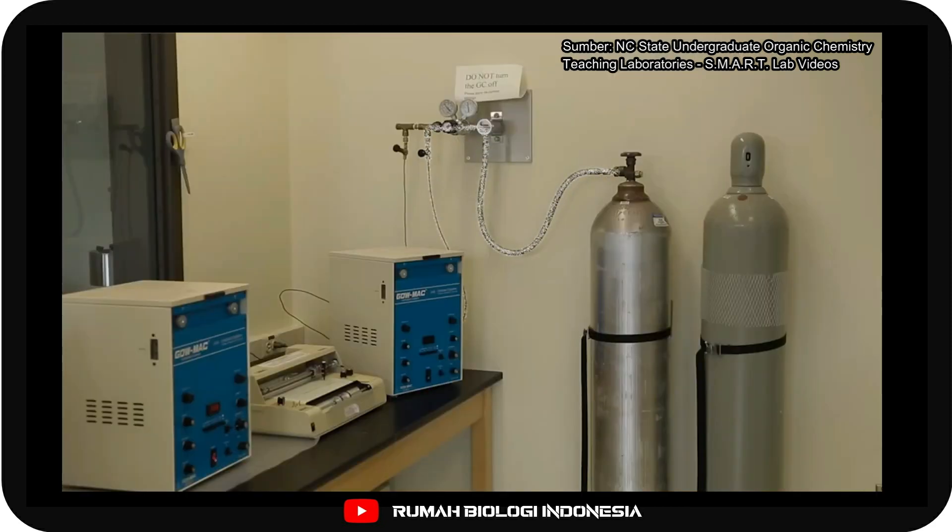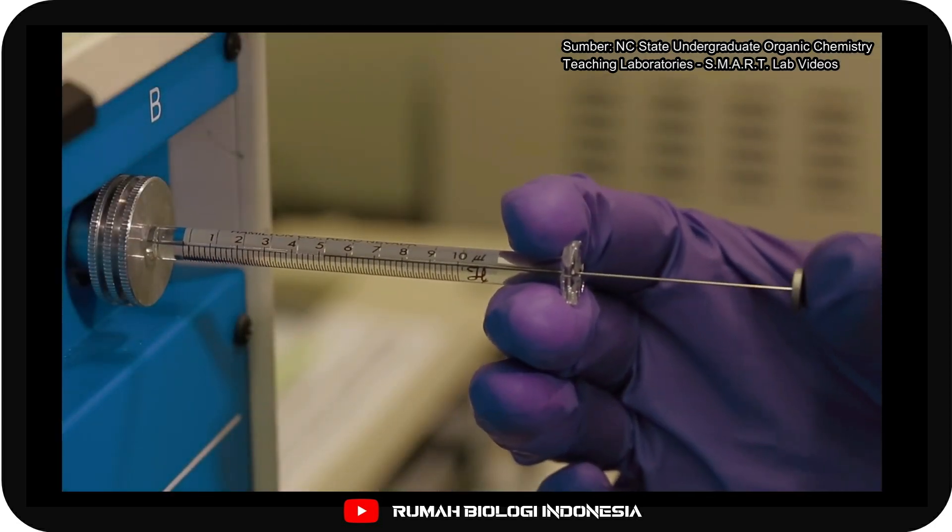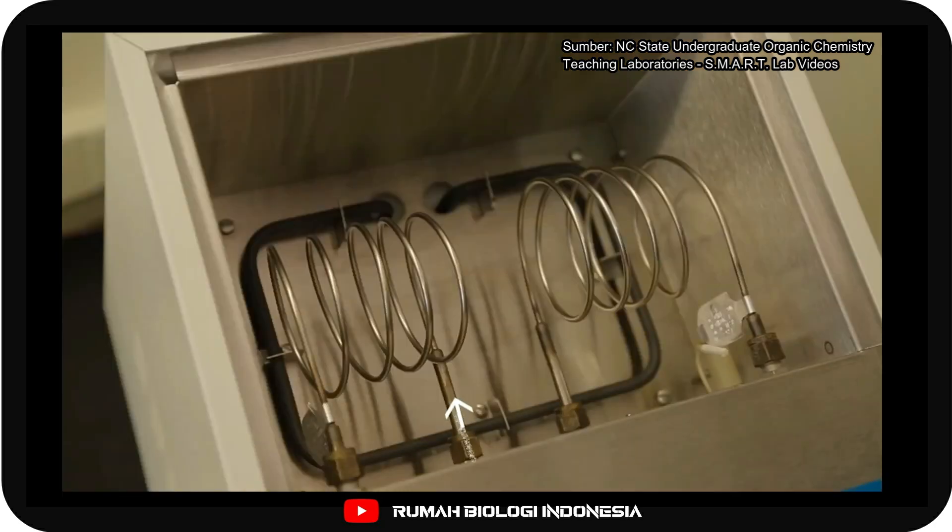Helium runs through the column and is the mobile phase. A sample injected into the gas chromatograph is instantly vaporized in a heated injection chamber so that the components are in the gas phase and then it flows through the column.